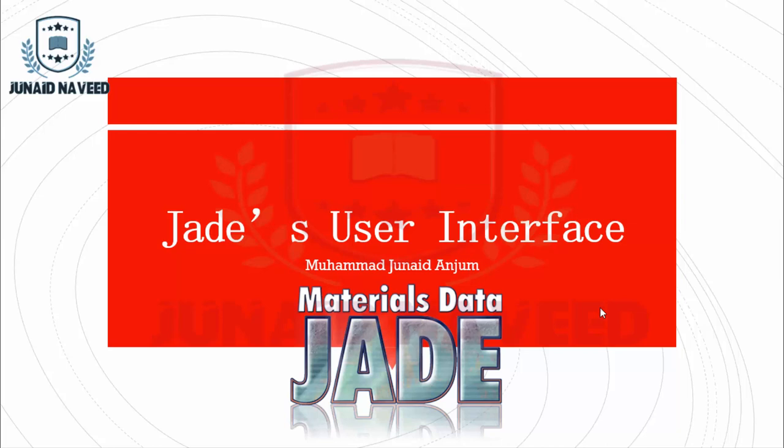Today is the first lecture in which we will be discussing the Jade main window, and I will discuss in this main window different toolbars and some basic tools of Jade. So let's begin.